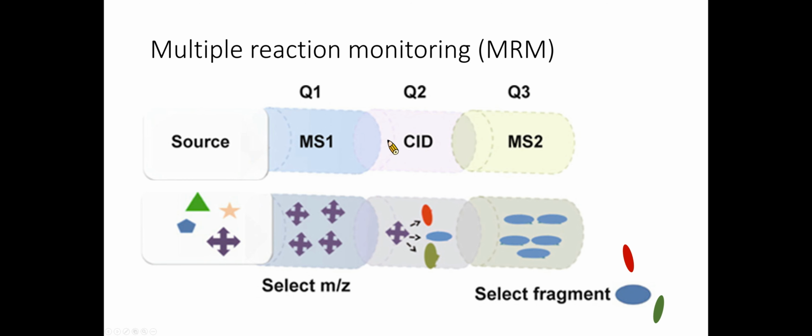Multiple reaction monitoring is essentially multiple SRM. One can simultaneously or nearly simultaneously monitor the SRM transitions of the quantifier and qualifier of an analyte, which would further enhance the analytical specificity. However, the instrument may spend less time, or duty cycle, in each SRM channel if we include too many SRM channels for monitoring, which may result in loss of sensitivity.